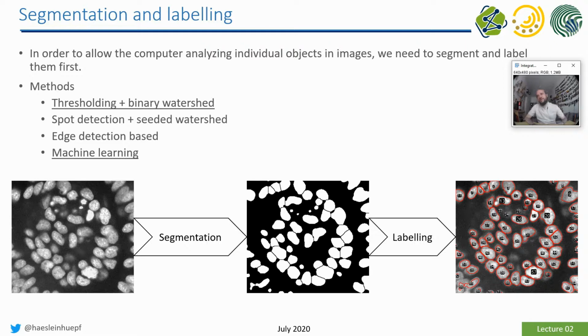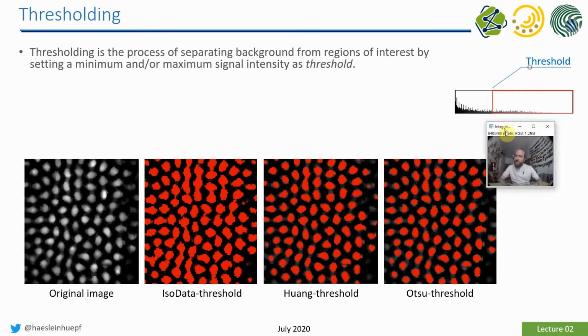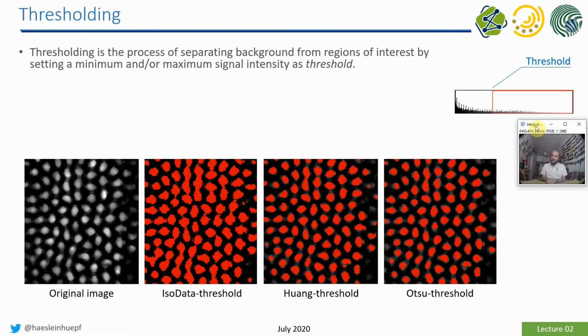more sophisticated scenarios. Thresholding basically means you take the range of intensities which exist in the image, and you say all intensities above this particular threshold belong to my object, and the intensities below do not. You can take the original image and threshold it. You can take a blurred image and threshold it. And when you think about what machine learning is doing, it actually applies thresholds to a couple of images at a time in order to figure out what are objects and what are background.